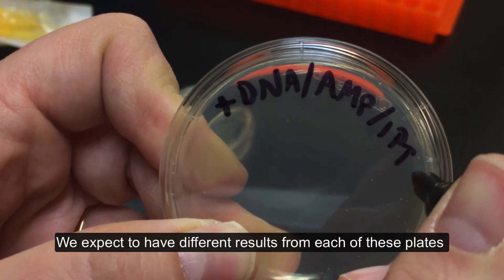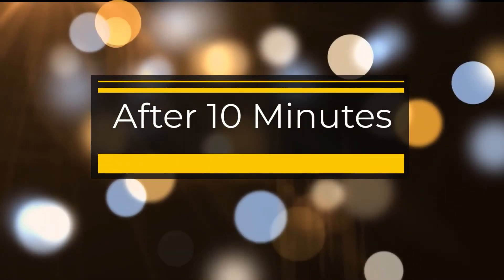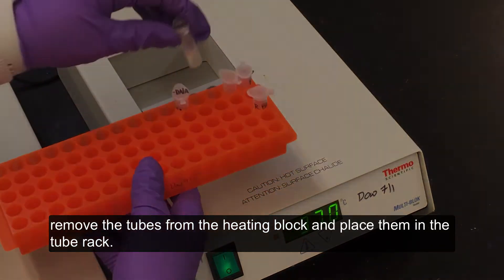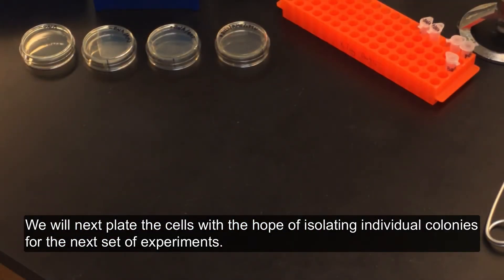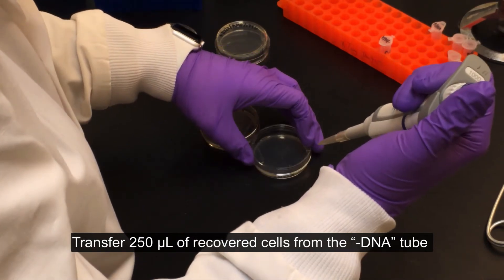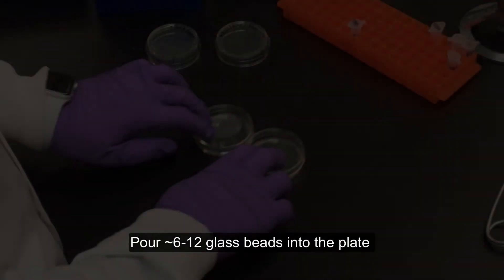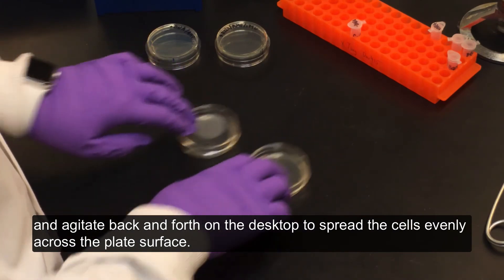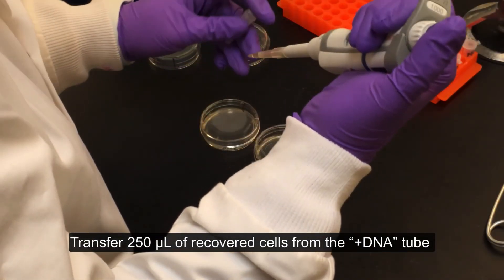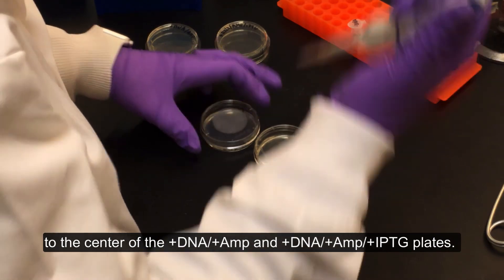We expect to have different results from each of these plates based on the additives that are present. After the 10 minute recovery period, remove the tubes from the heating block and place them in the tube rack. We will next plate the cells with the hope of isolating individual colonies for the next set of experiments. Transfer 250 microliters of recovered cells from the minus DNA tube to the center of the minus DNA and minus DNA plus ampicillin plates. Pour approximately 6-12 glass beads into the plate and agitate back and forth on the desktop to spread the cells evenly across the plate surface. Discard the beads in the waste bead container. Transfer 250 microliters of recovered cells from the plus DNA tube to the center of the plus DNA plus ampicillin and plus DNA plus ampicillin plus IPTG plates.